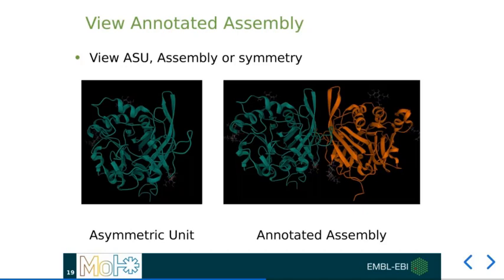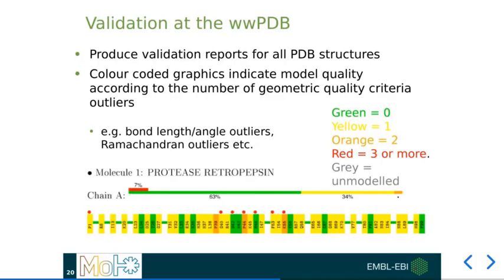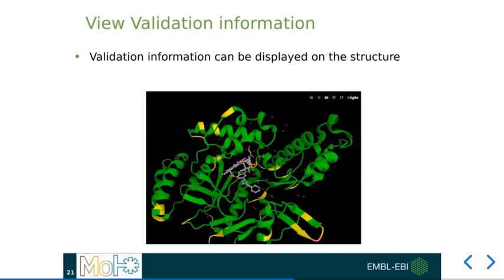I'd like to think that perhaps most of you are familiar with the PDB's validation reports that we produce both during deposition and alongside our entries online. Now, these have a simple color code from green to red that describes the accumulation of geometric issues at the residue-specific level. Using this information, we can combine it with a coloring scheme across our protein, so that we can start to visually interrogate our validation metrics from any entry from the PDB archive.